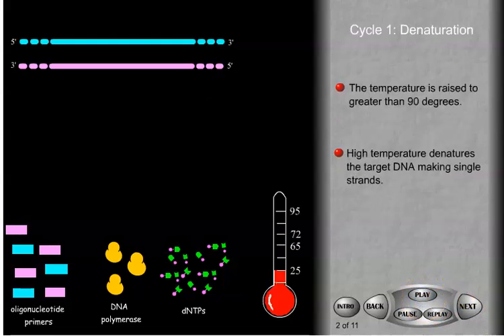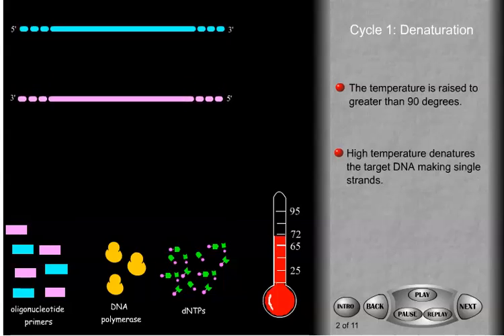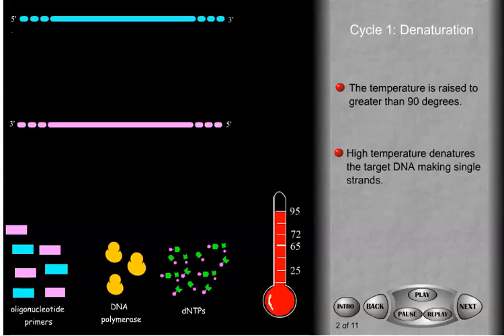Each cycle consists of 3 steps: denaturation, annealing, and extension. In the denaturation step, the temperature of the reaction is raised to above 90 degrees C in order to break the hydrogen bonds between strands and produce single-stranded DNA.